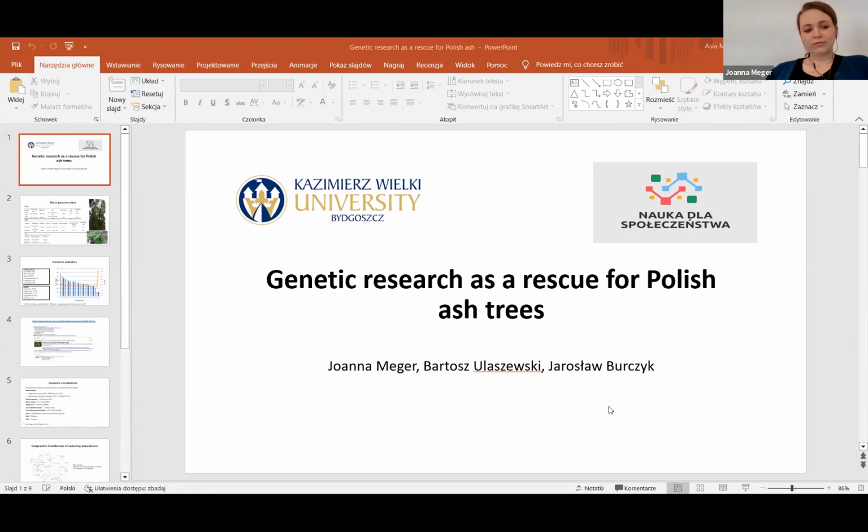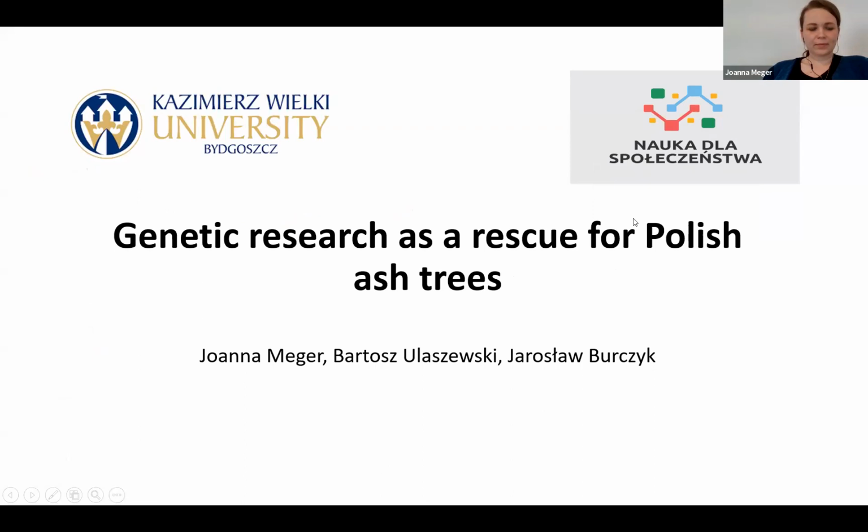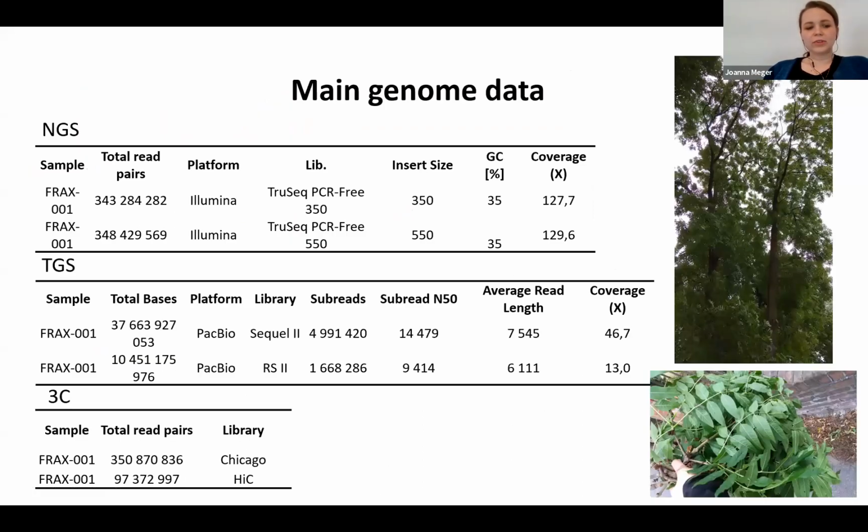Thank you, Richard, for the opportunity to talk about our project, Genetic Research as a Rescue for Polish Ash Trees. Our team has developed a new genome of Fraxinus excelsior. This reference genome was generated from a female tree with potential resistance to Hymenoscyphus fraxineus from the botanical garden at our university. The assembly utilized Illumina, PacBio, and HiC data.